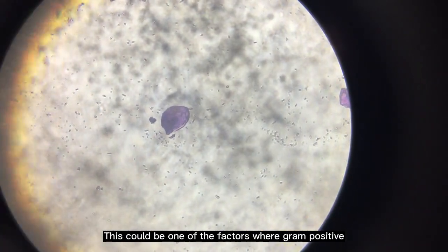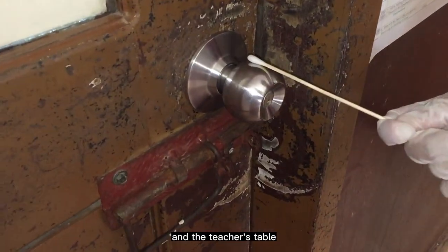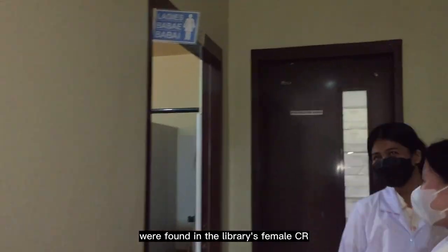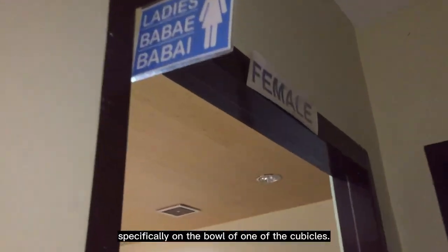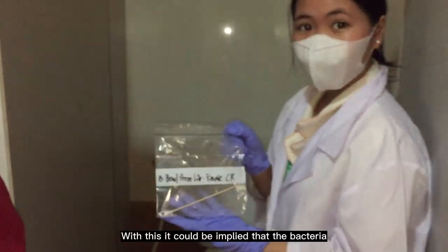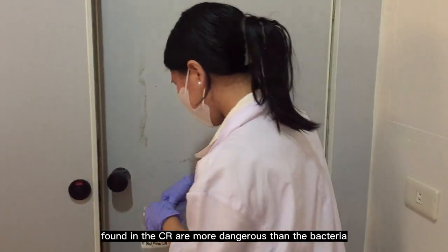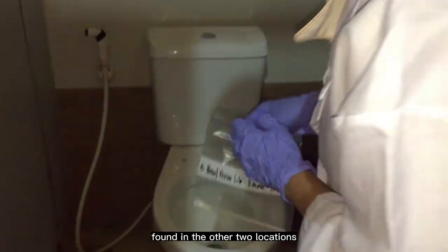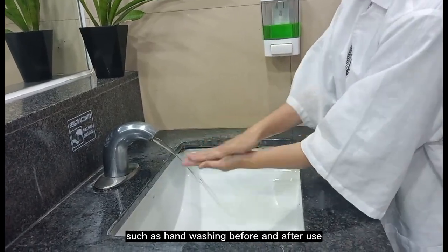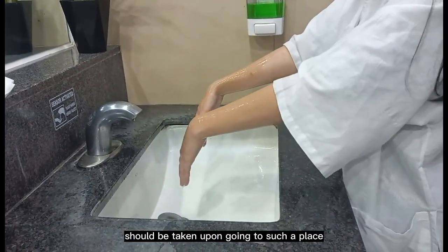This could be one of the factors why Gram-positive bacteria were found in the Dean's Doorknob and the Teacher's Table, while Gram-negative bacteria were found in the library's female CR, specifically on the bowl of one of the cubicles. With this, it could be implied that the bacteria found in the CR are more dangerous than the bacteria found in the other two locations. Thus, preventive measures such as hand washing before and after use should be taken upon going to such a place.